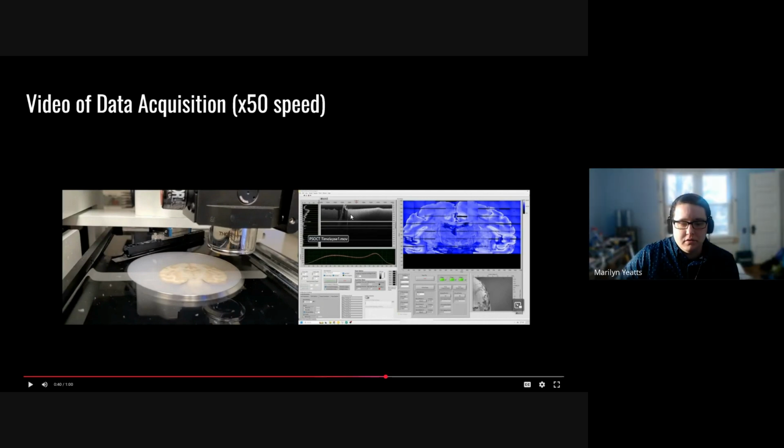And then on the right of that, if I take these A-lines for every single part of the scan and line them up side by side, that's what gives you my depth profile. So you can see the surface of the tissue is here. This is the surface of the gel right there. And I did pause it on a very ugly section around the cerebellum, so this is why it's so ugly and jagged. But usually it's very, very smooth. This is just not a great B-line. But that's what a B-line is, what a depth profile is.